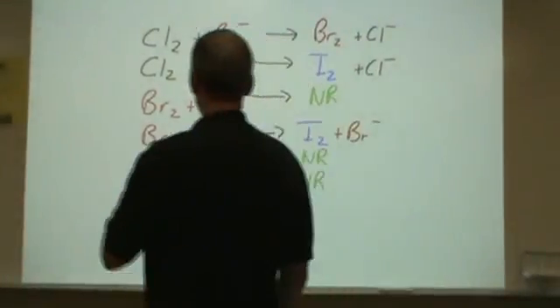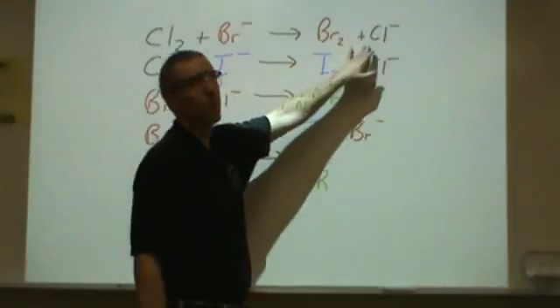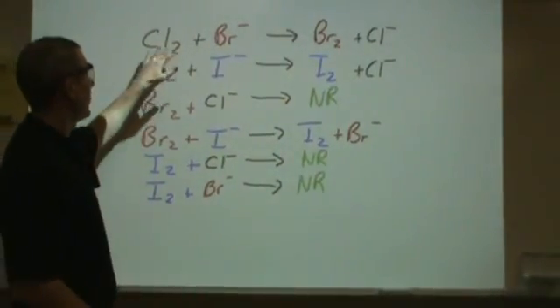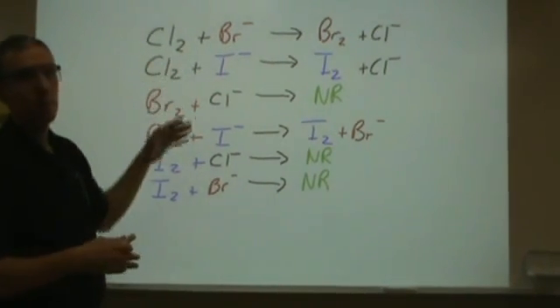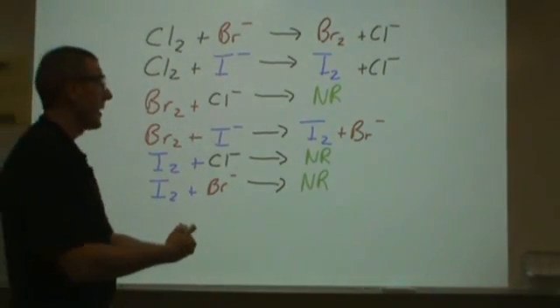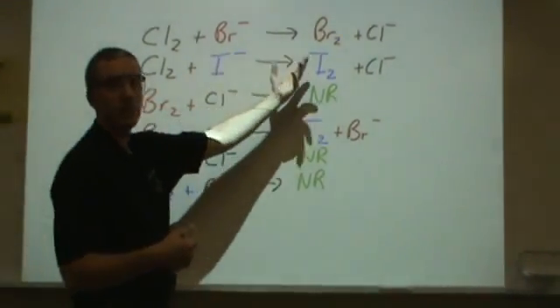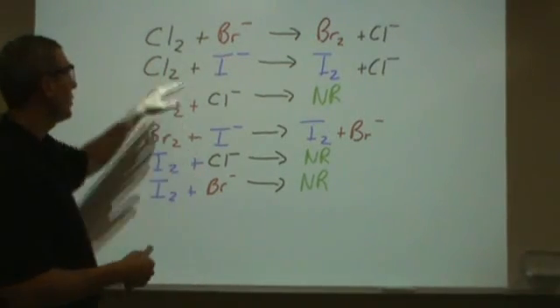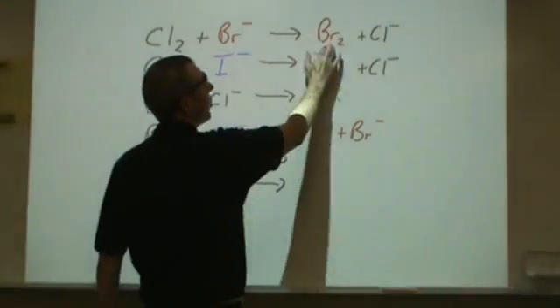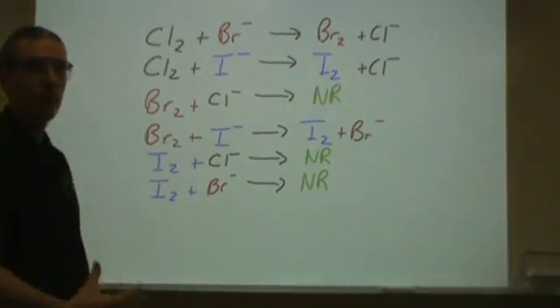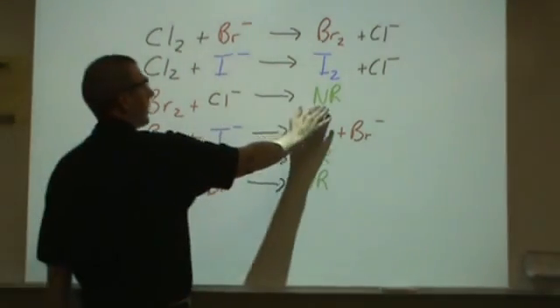Here's the breakdown of those six test tubes. In test tube one, I mixed chlorine and bromide, and I ended up with bromine and chloride. Essentially what's happening is you're presenting a charged halide ion with a free halogen. Either the free halogen is capable of removing that electron from the halide and you have a reaction take place, or it can't. For each one that it can, the opposite can't. If chlorine reacts with bromide, then bromine will not react with chloride in the reverse direction. If I do the reverse down here, nothing happens.